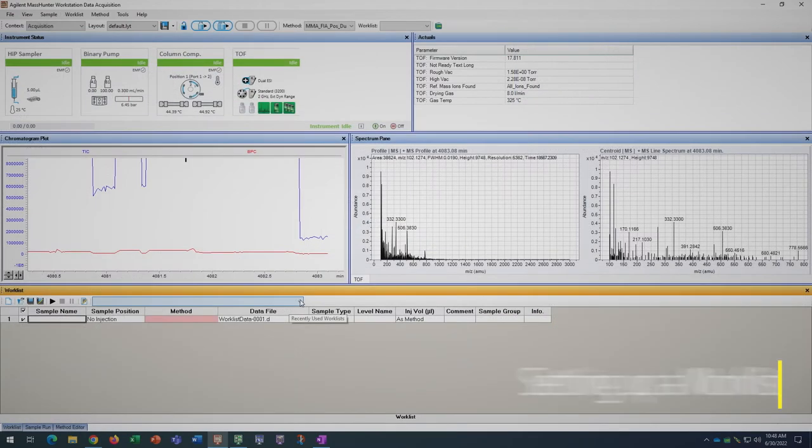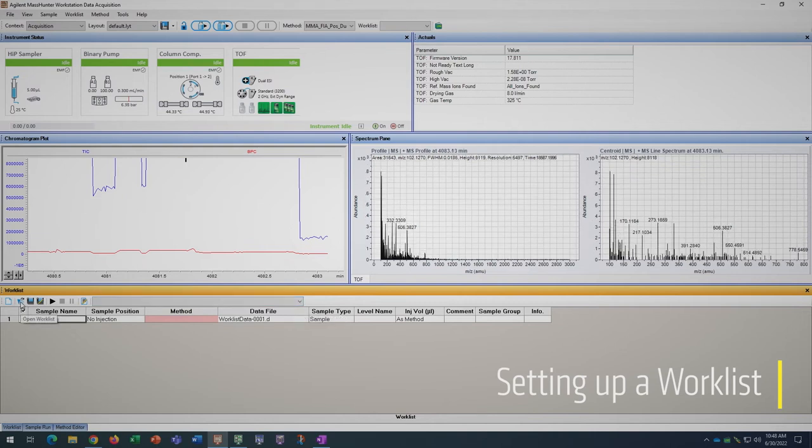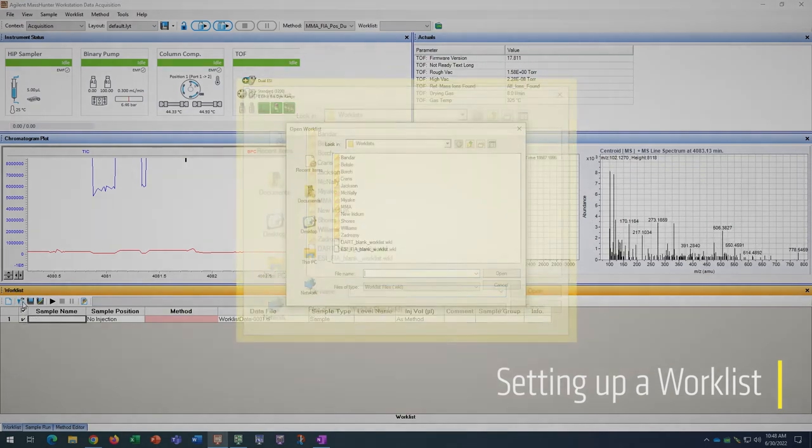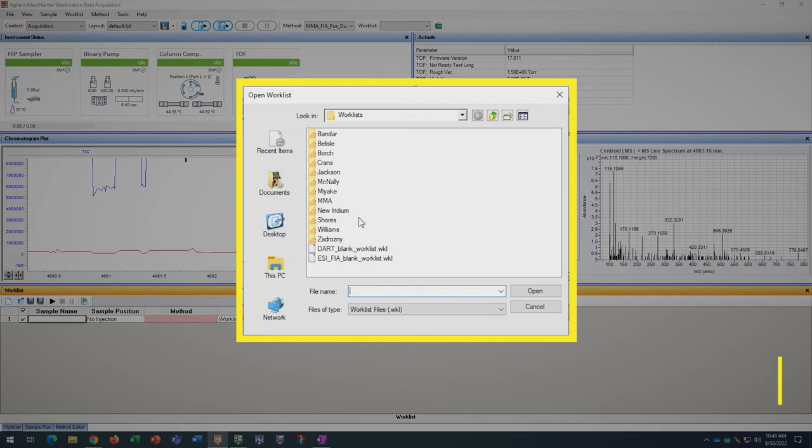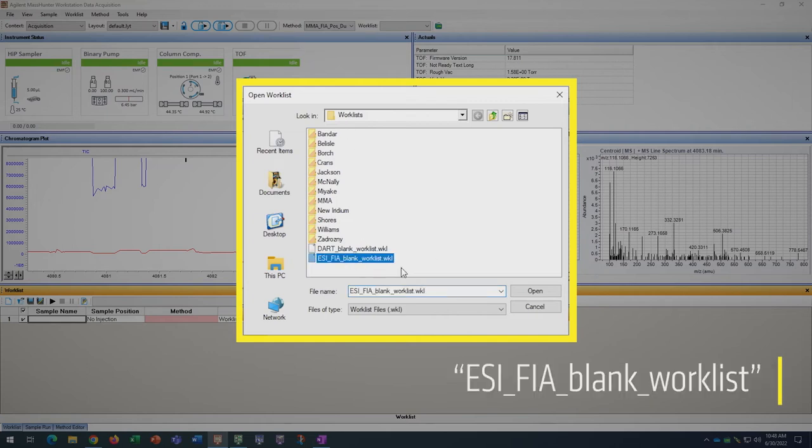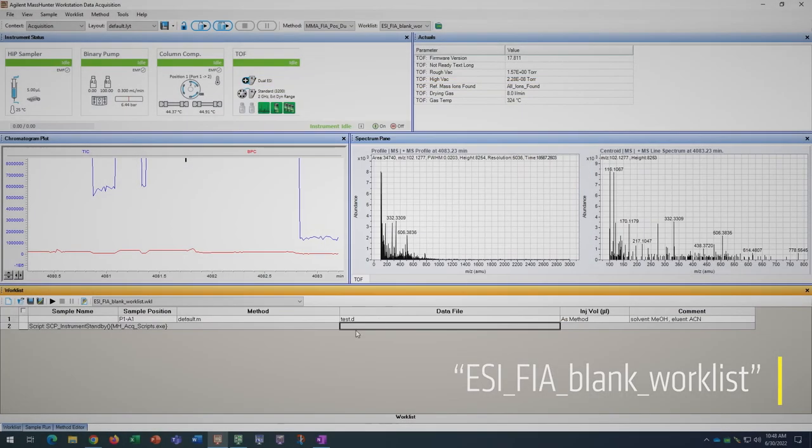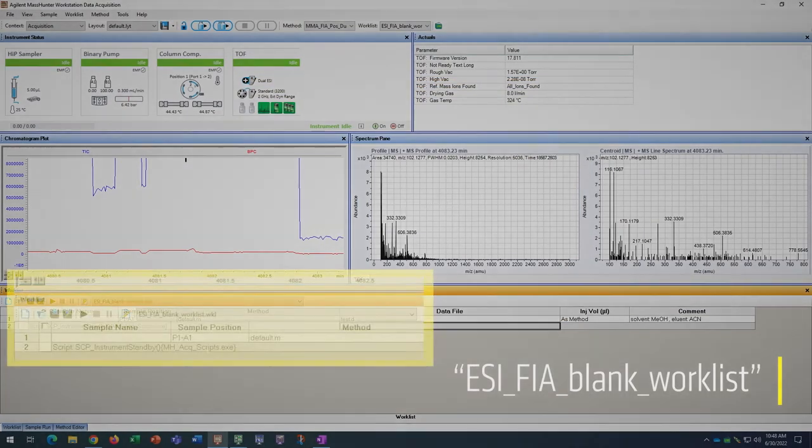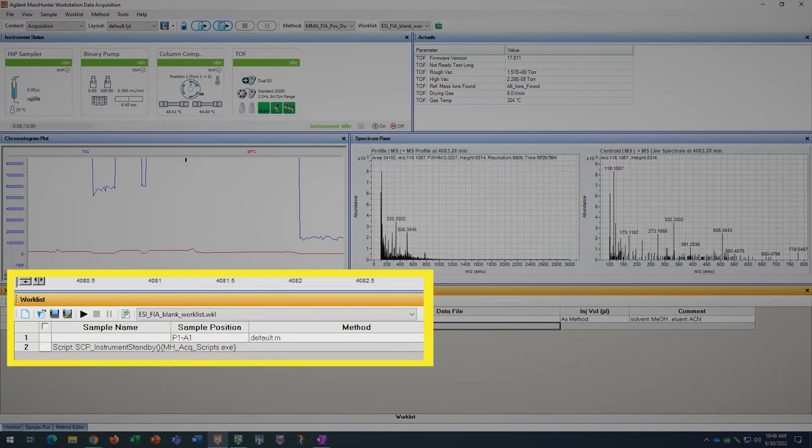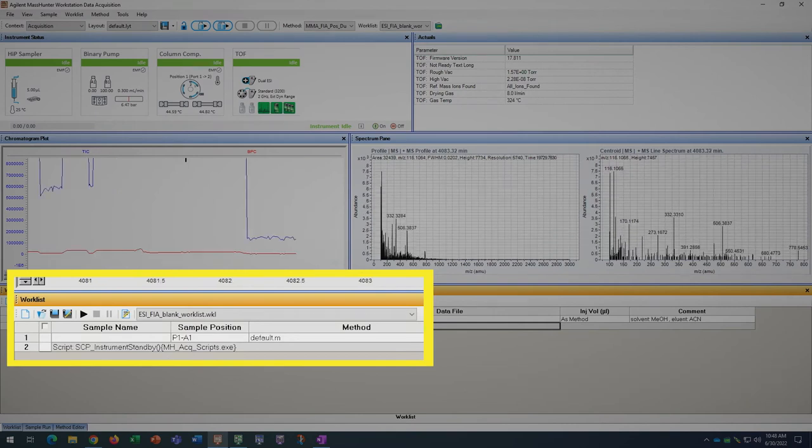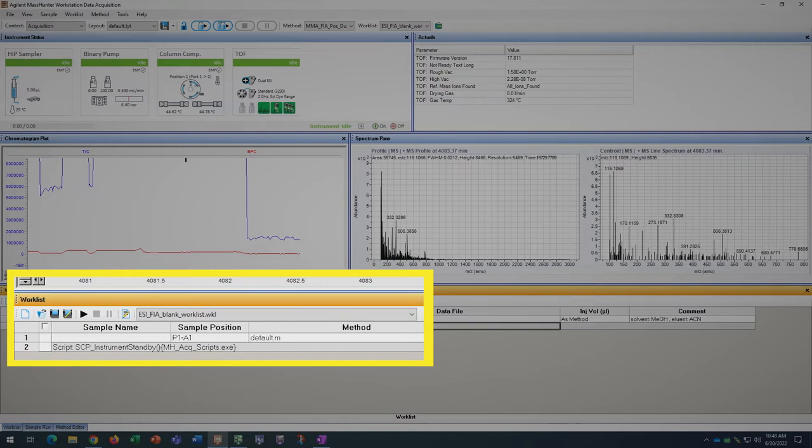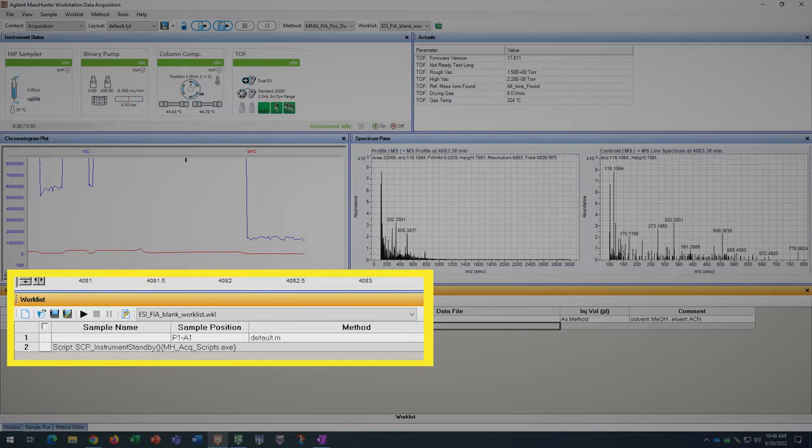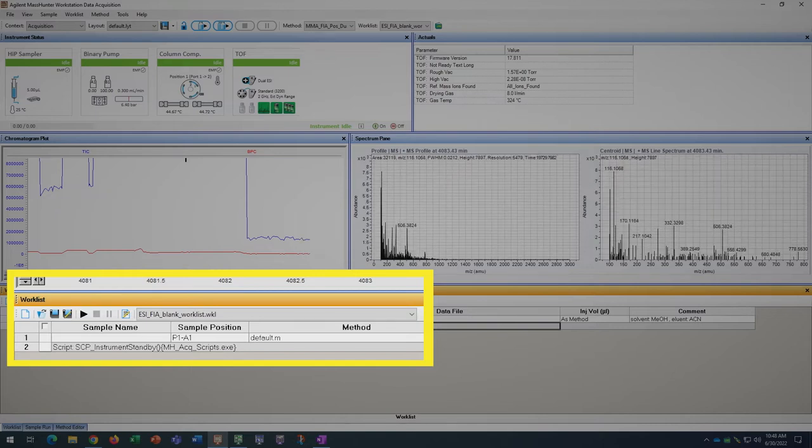Now we are going to set up our autosampler worklist. The best way to do this is to start from either a recent worklist or the available ESI FIA blank worklist that includes the instrument standby script at the end of it. This script serves to automatically put the instrument on standby when your samples are done running.